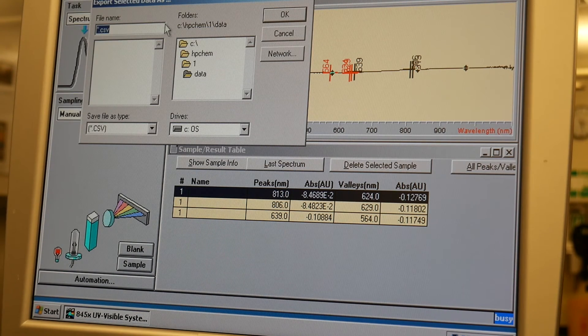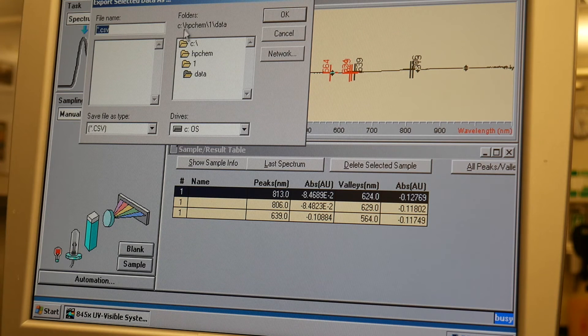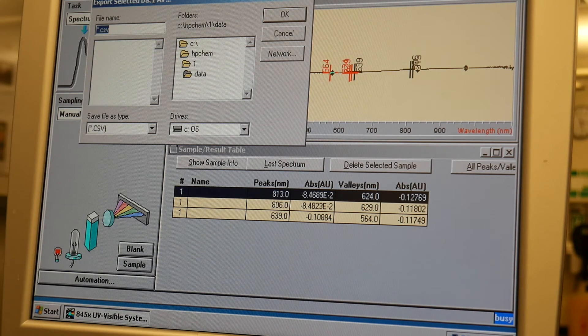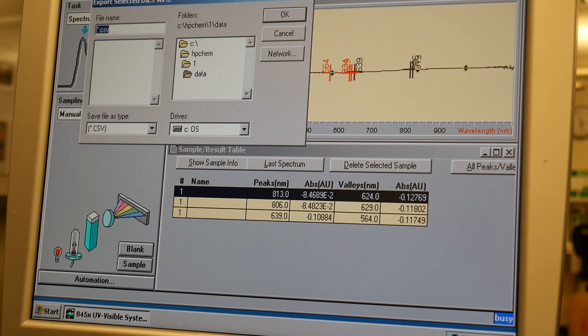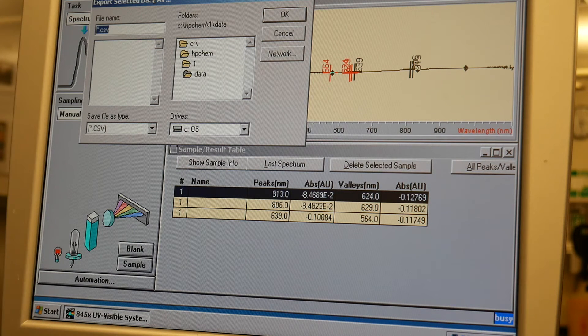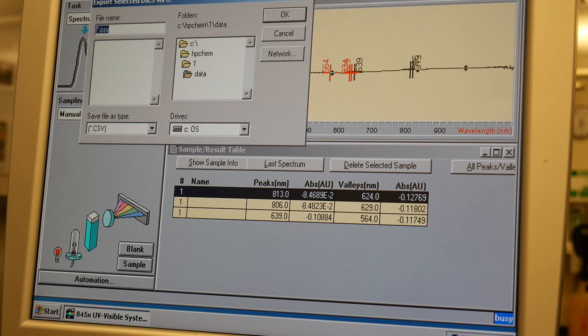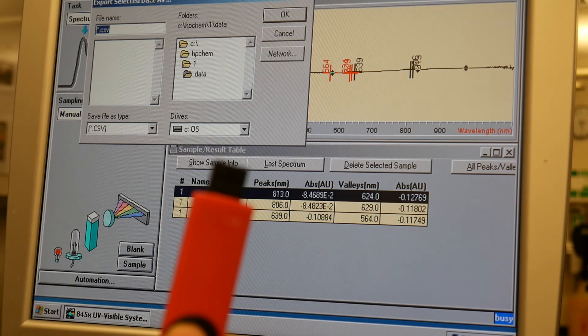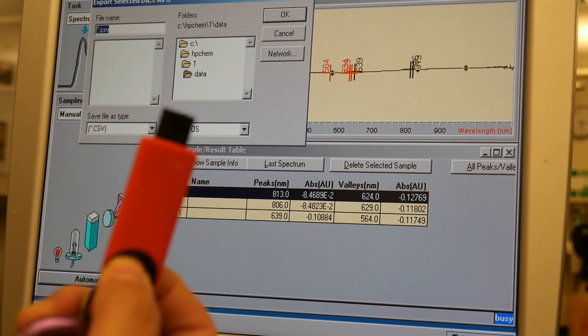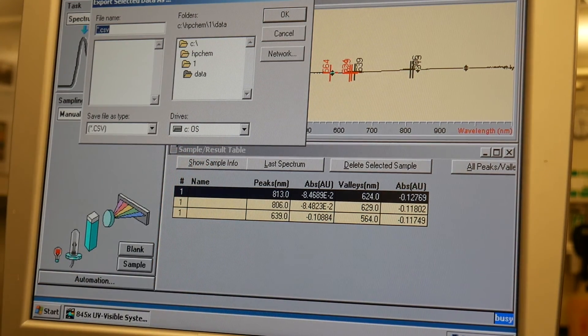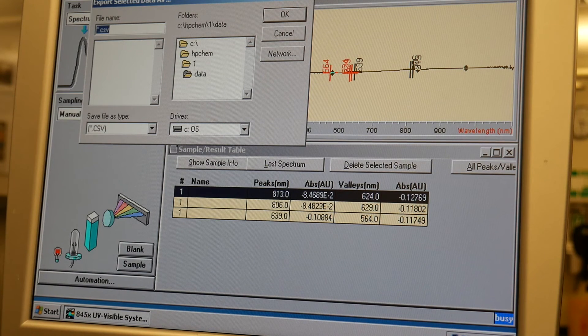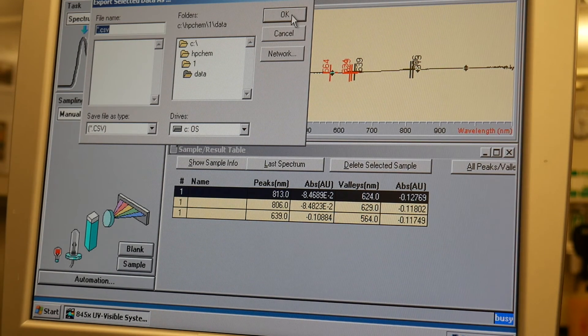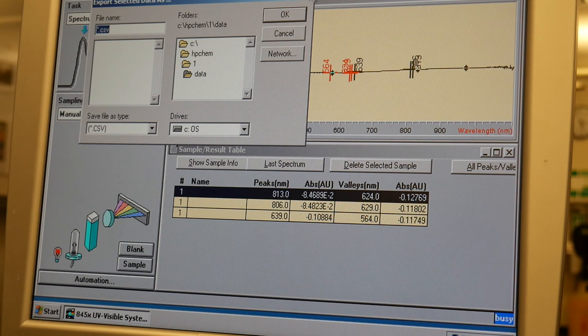And now there are places where you can export it. So you can export it to your folder on the Orca server. Or in my case, what I'm going to do, I just have my thumb drive and I'm going to save it to my thumb drive. And that's actually the easiest. If you bring in a USB drive, that's the easiest way to save your data.